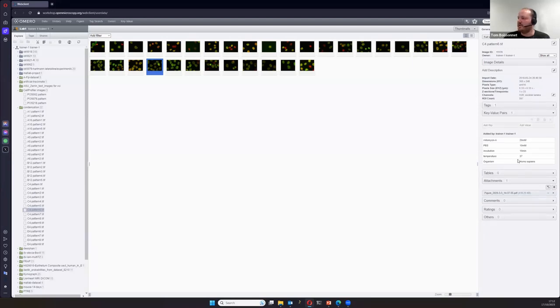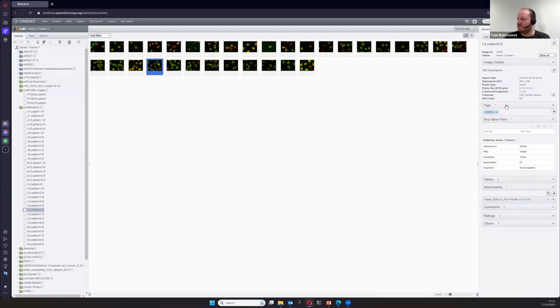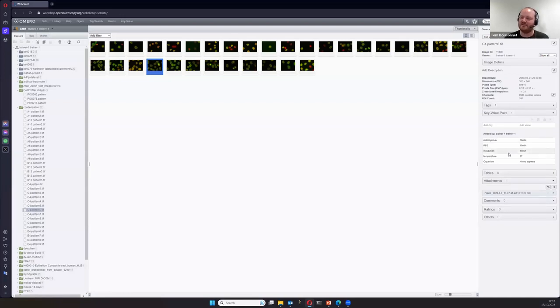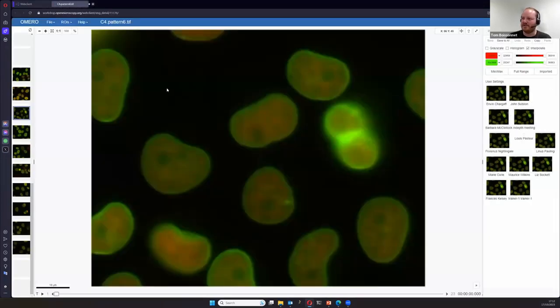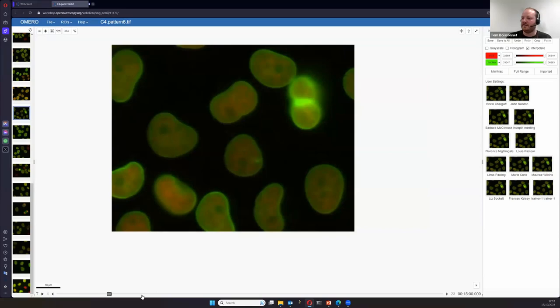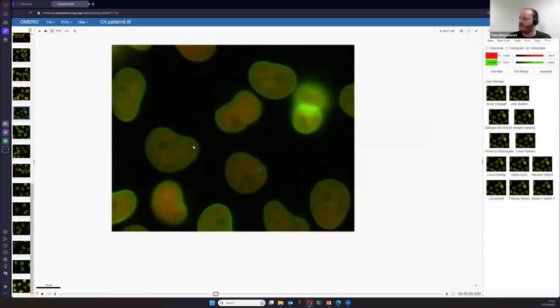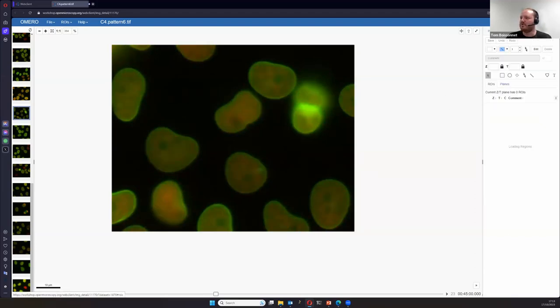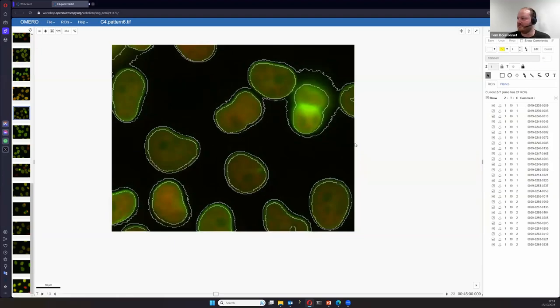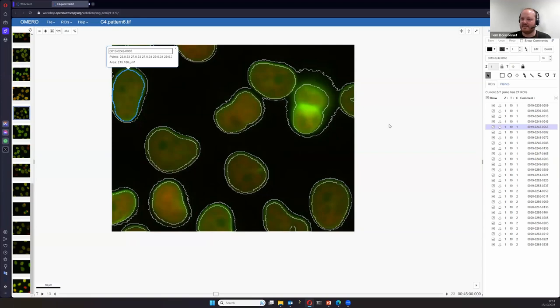All the rest would be annotations like tags or key-value pairs to add dictionary-like information to your images or datasets. By double-clicking an image you can preview and browse your images. OMERO Web helps you browse your data, view it, rearrange the contrast to explore your data. If you have ROIs attached, this is where you could explore your image analysis results.